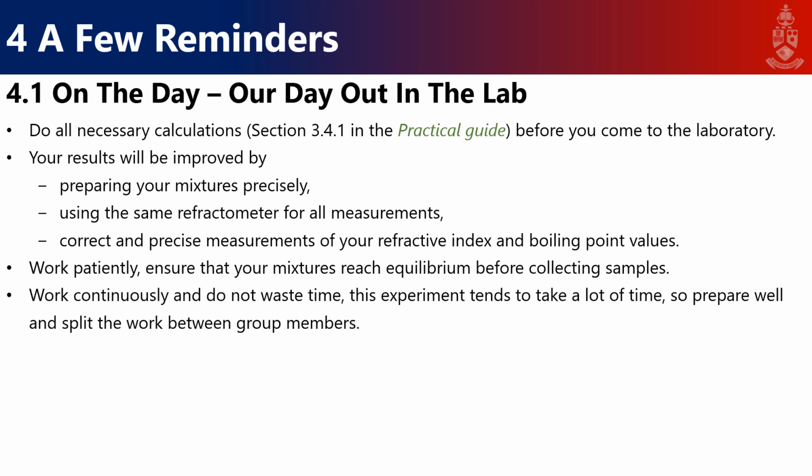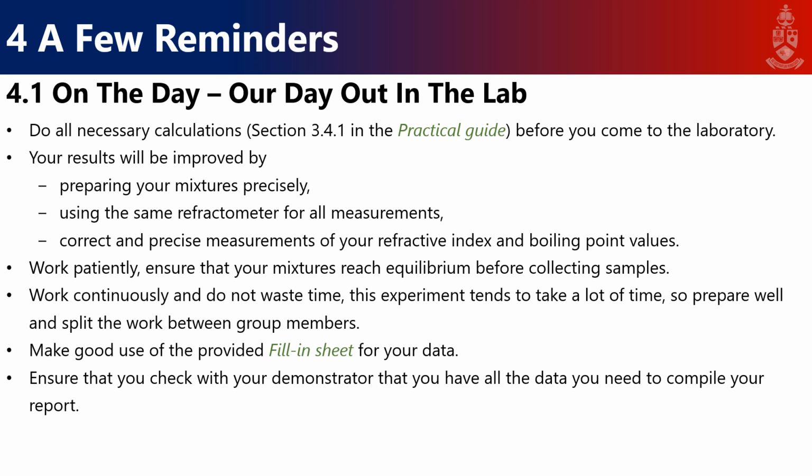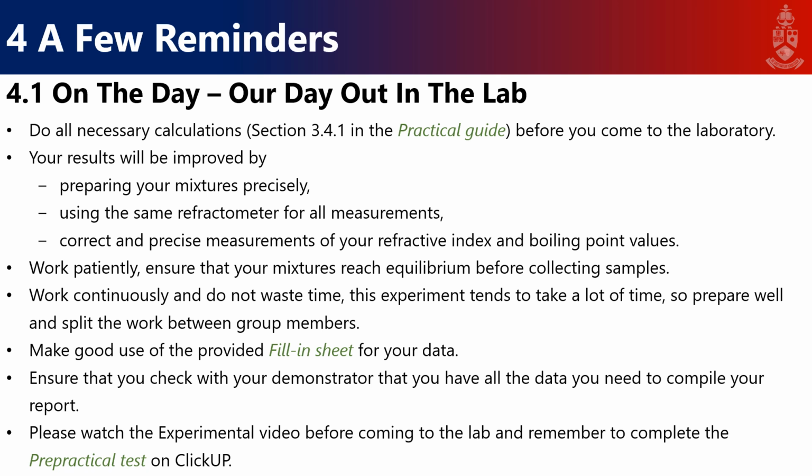Please work patiently, and ensure that your mixtures reach equilibrium before you collect samples. Also work continuously and do not waste time. This is quite a long and tedious experiment and you only have 3 hours to complete the experimental work. Prepare well and split the work between group members. Make sure that you use the provided fill-in sheet to collect your data and double check with your demonstrator that you've collected all the data necessary to compile your report. Please watch the experimental video before coming to the lab and remember to complete the pre-practical test on ClickUp.